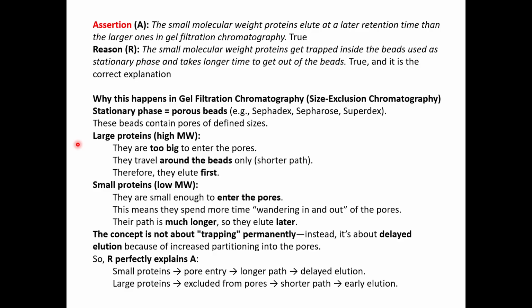so that you can separate particular molecular weight proteins. And if your range is very large, you can go for higher pore size. Or if your range is very narrow, if you want to separate proteins which have molecular sizes very close to each other, you can go for lower pore size or pore sizes within that particular range.